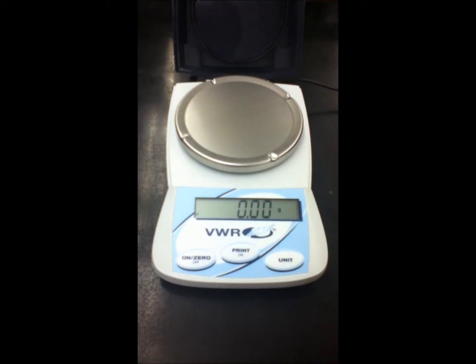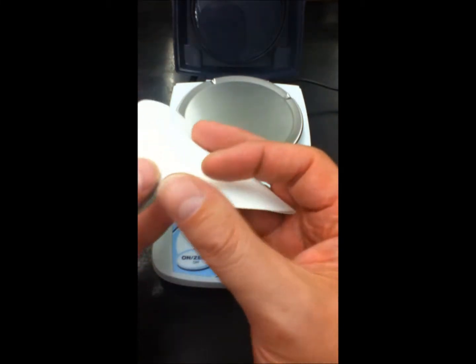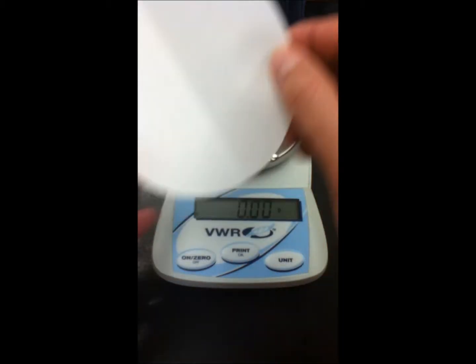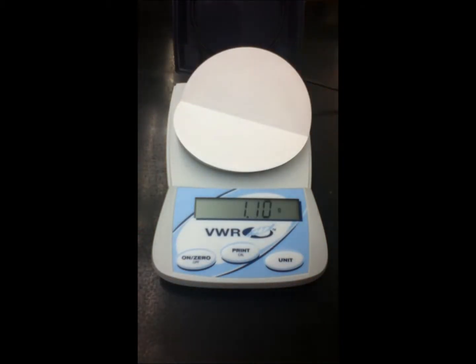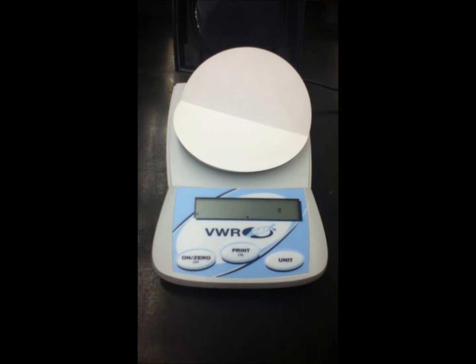We've got our scale on, already zeroed for us. We've got some filter paper which I've folded in half, and we're going to place it on the scale — folded in half so it's easier to pour our chemicals where we want. It's now at 1.10 grams, so we press the zero button so it's now at zero. Anything we add to the scale is the mass we're trying to create a solution with.